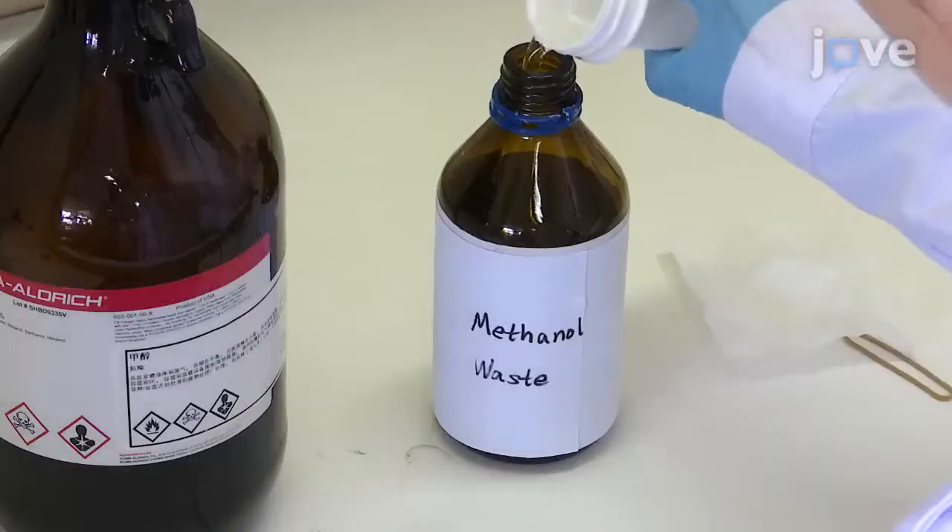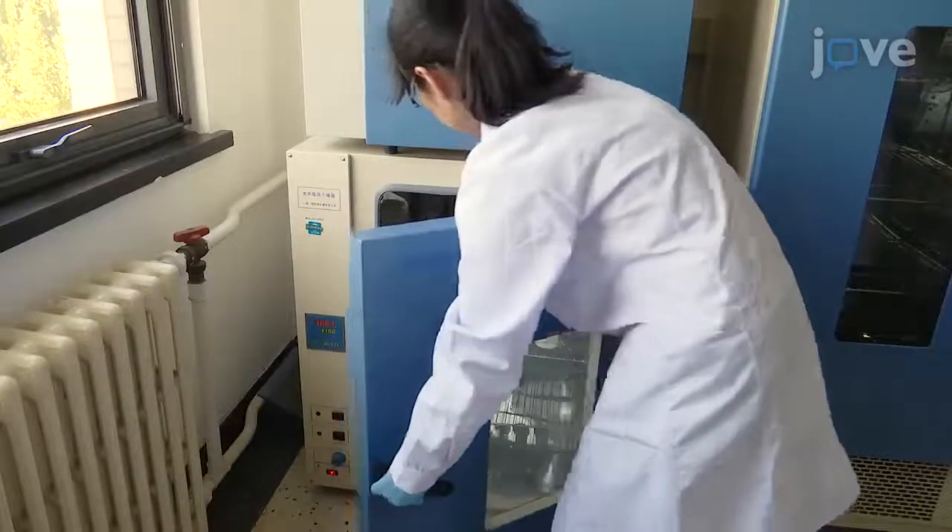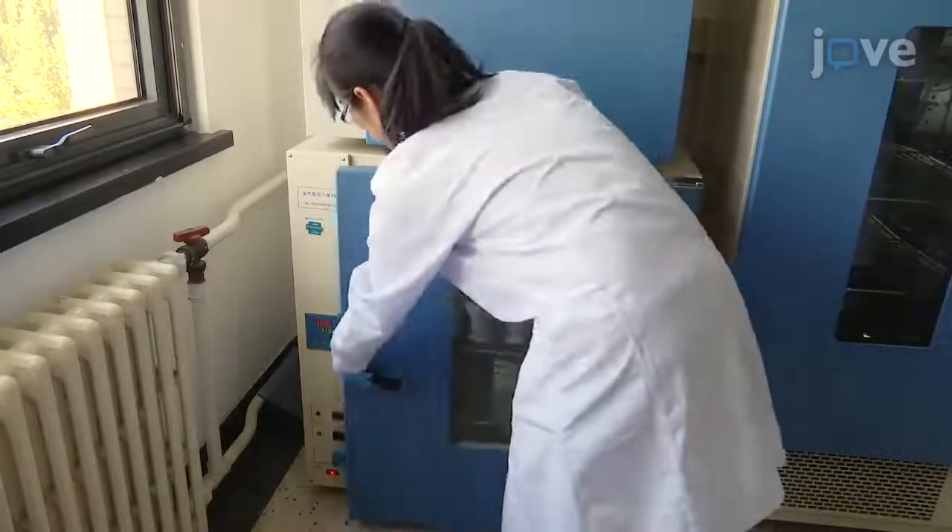Now, rinse the coverslip with methanol, and then place the staining jar back into the 110 degrees Celsius oven to dry the coverslip.